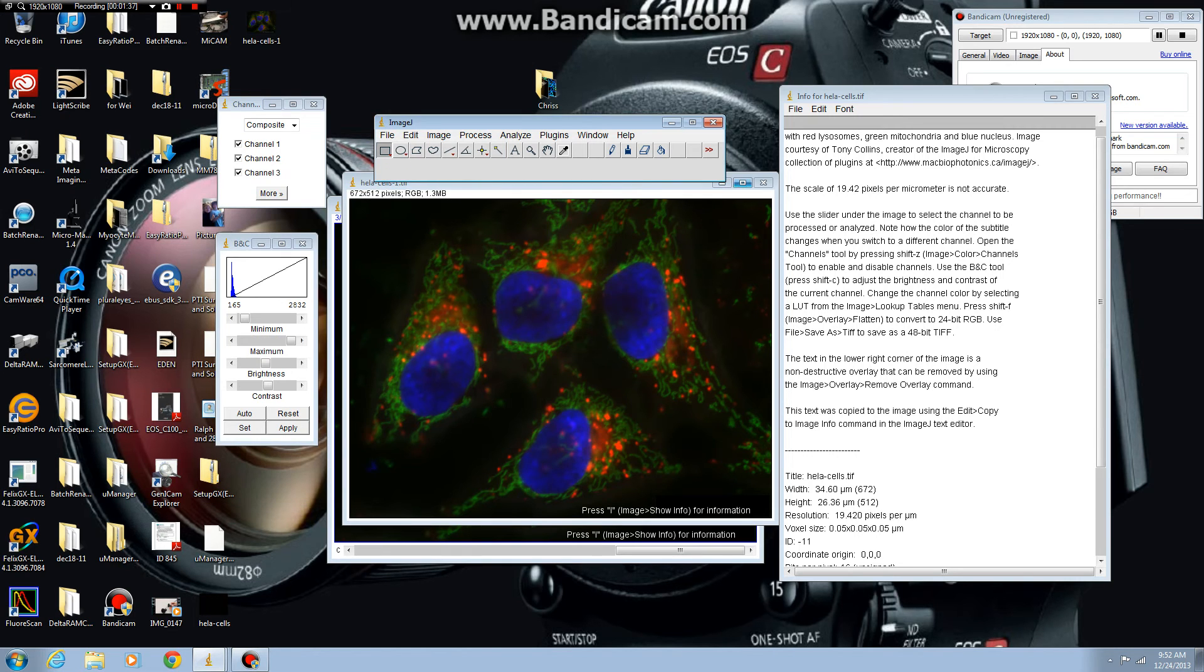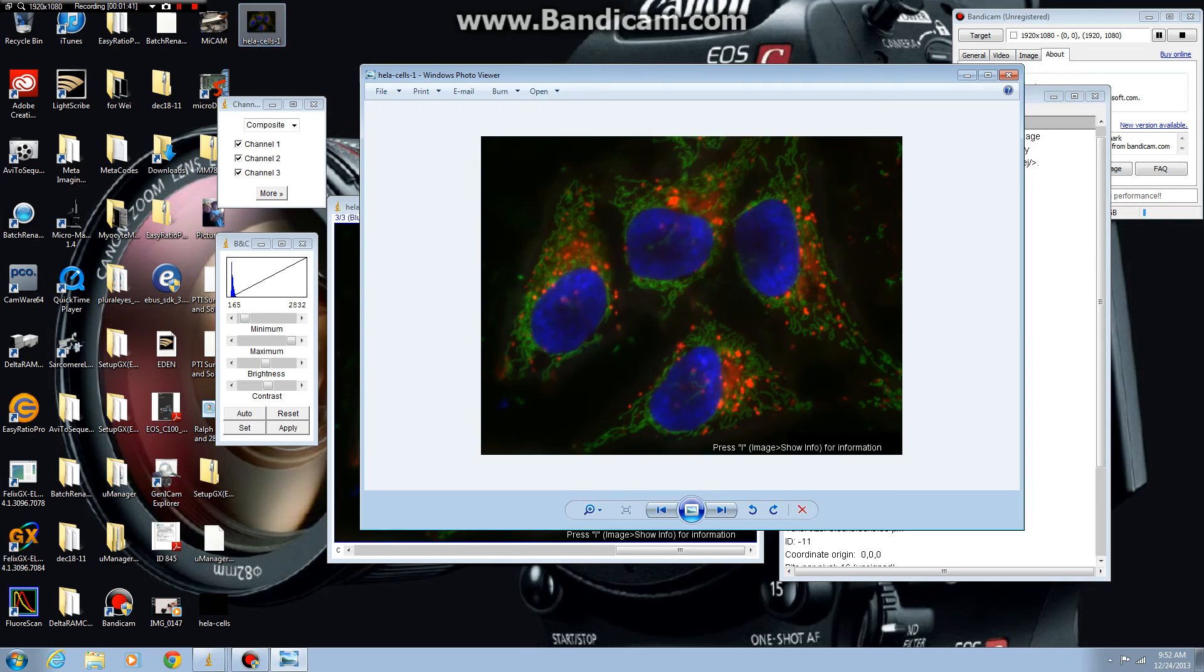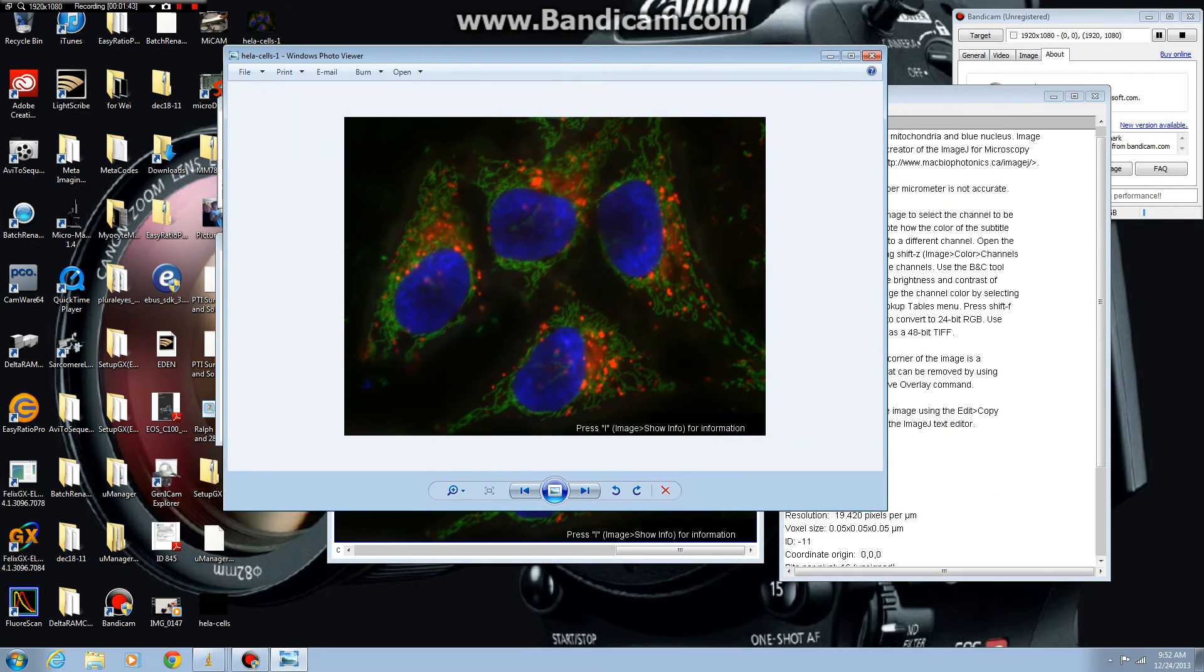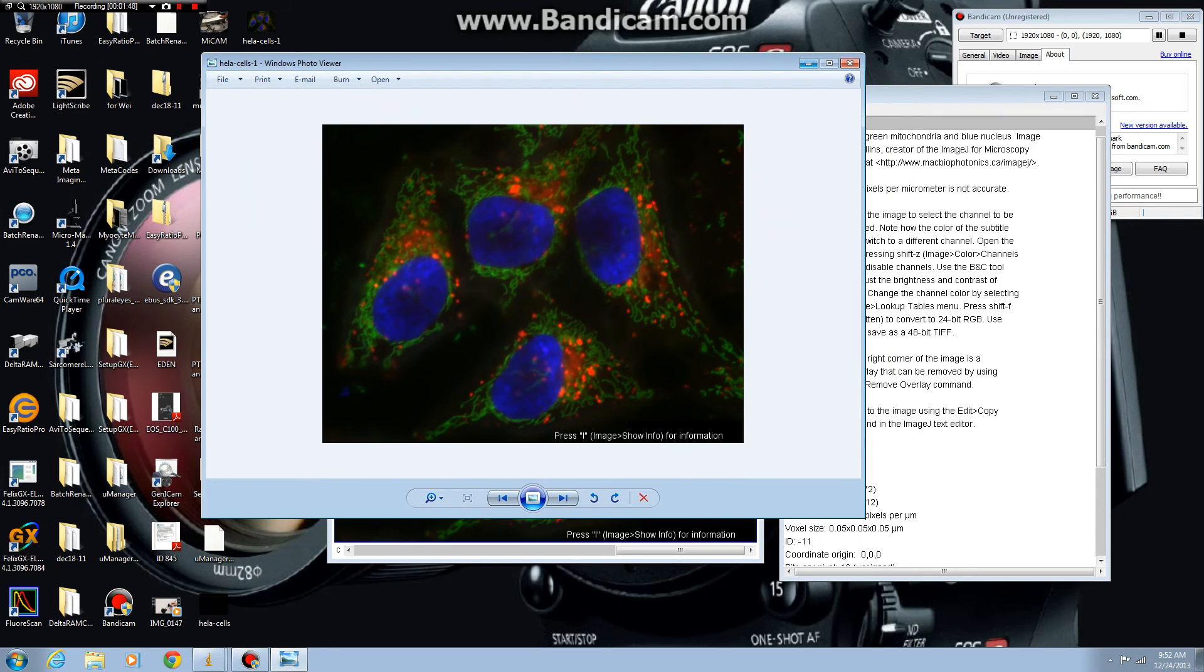And now close the window and you can see on my desktop here is HeLaCells1 as a standard RGB TIFF. This can be opened or saved into any of Microsoft or OpenOffice products.